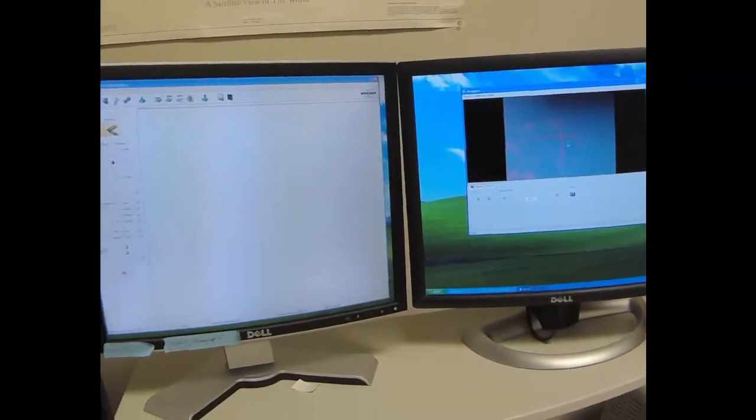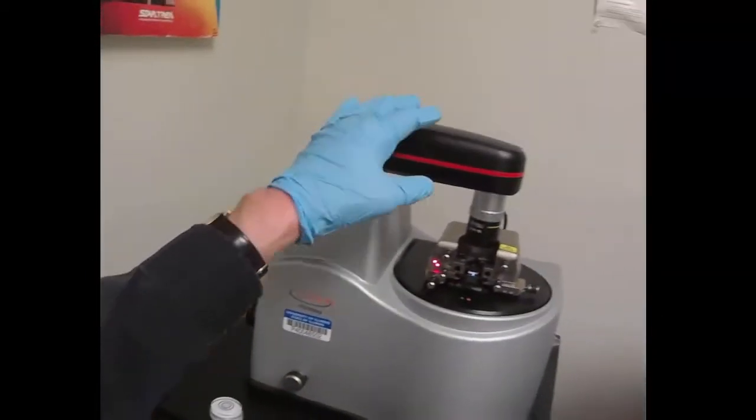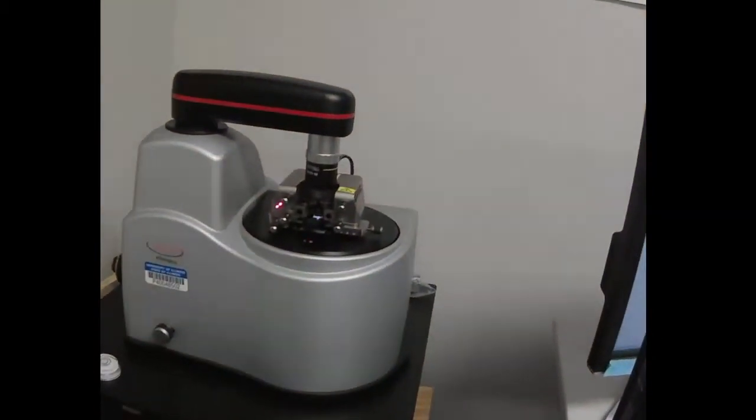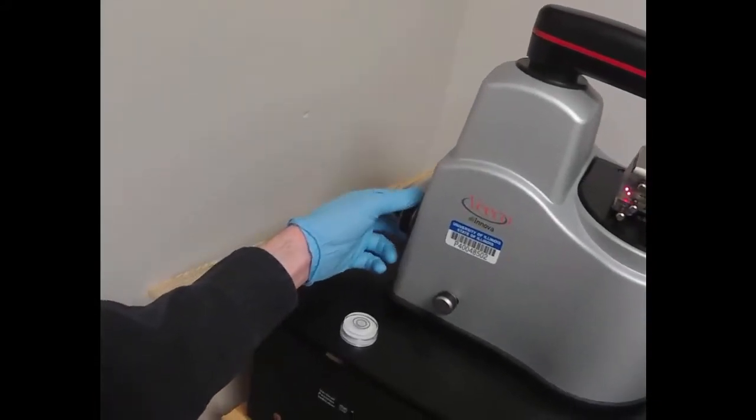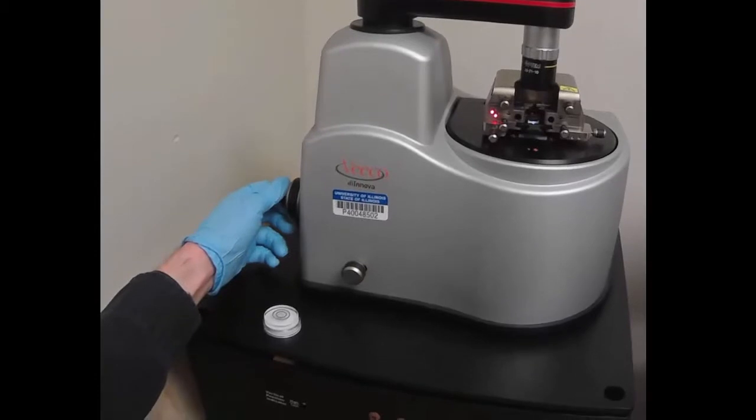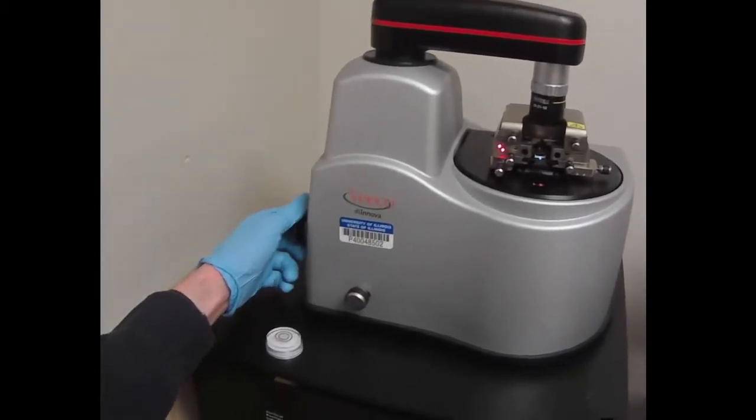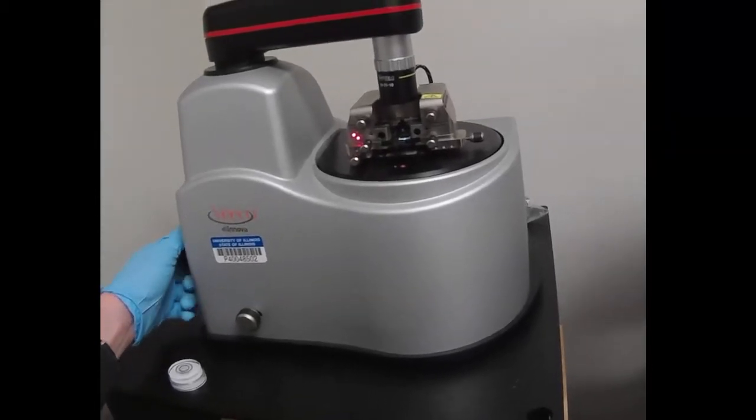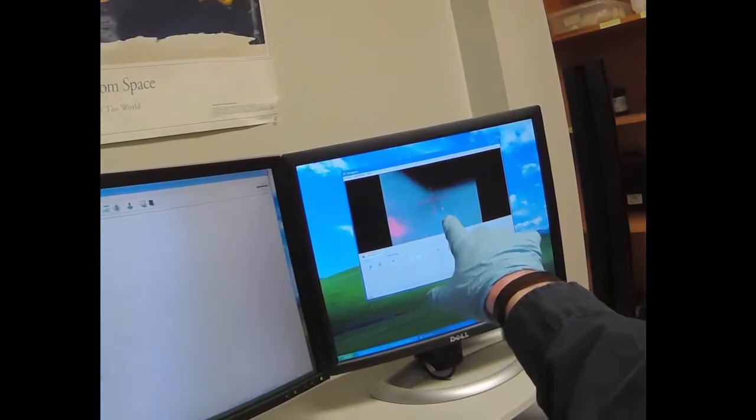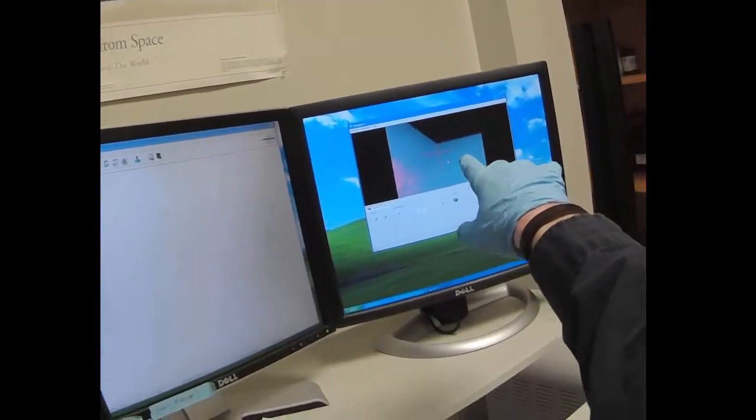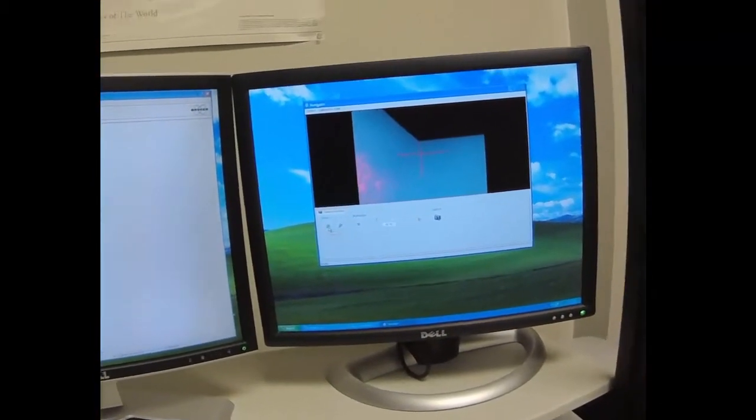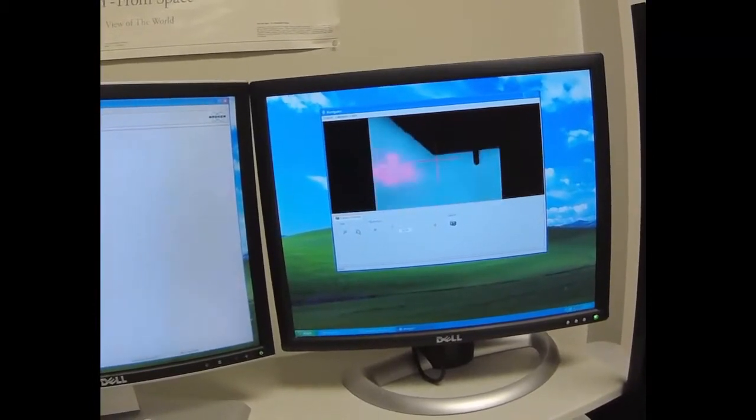So what I'm going to do is focus my optical boom camera here, and this is the live camera display, to see where the cantilever is. This is fine focus. This is coarse focus. Again, there's very few things you could break in this instrument, but you could break this motor if you force it too much. I never remember which way to turn to change the focus, but you can see the microscope is going up and down. As I do that, my image here gets in focus and out of focus. This is a piece of the chip that the cantilever is etched off of.